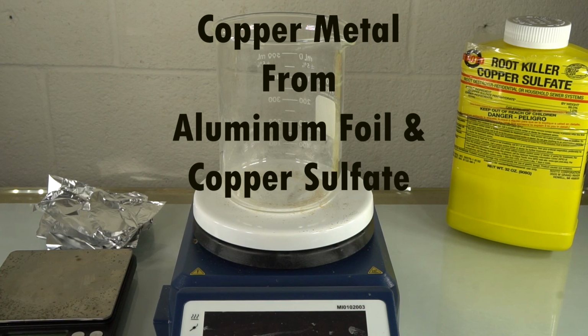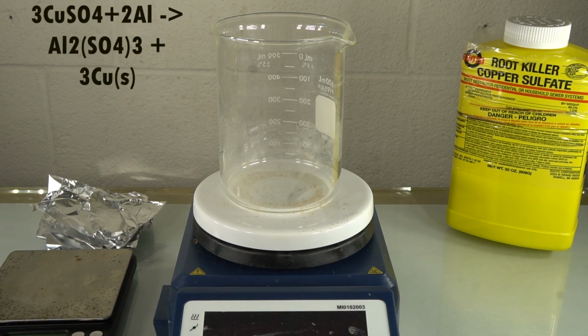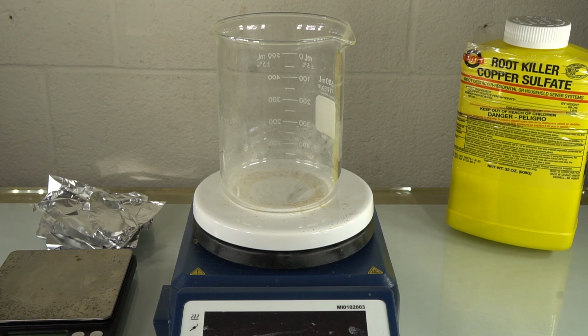Hi, this is Scott from Chem Talk, and today is a very special day because we are going to do one of my favorite all-time home chemistry experiments. We are going to make copper metal, elemental copper, from copper sulfate and aluminum foil. It's quite easy to do, and it's a great, very accessible experiment to show anyone who's really interested in science and chemistry.